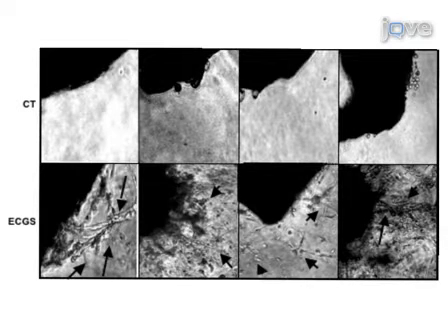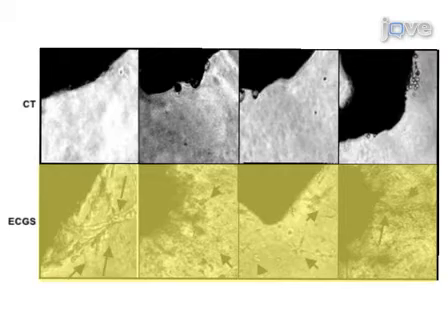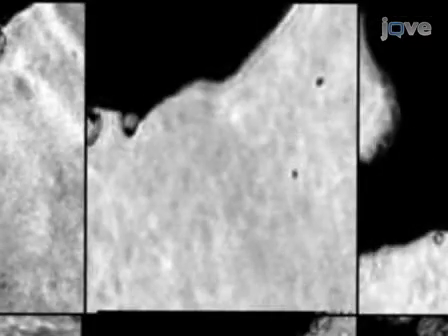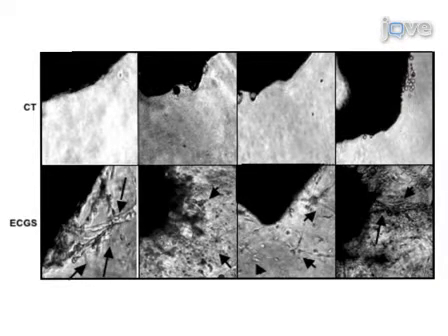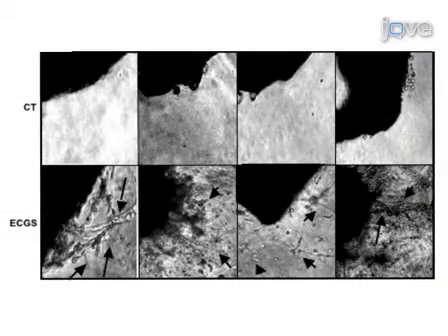These images were collected 12 days after placement of rings in the wells and incubation with either culture medium, seen in the top row of images, or ECGS used as a positive control for vessel sprouting, seen in the bottom panel. Each image is a representative snapshot of 4 out of the 12 rings, which is typically used in the assay per condition. Aortic rings that were exposed to ECGS exhibit vessel growth, and the arrows point to several of the many vessels that have formed. Each vessel is characterized as chains of endothelial cells with occasional branching, indicating that they are mature. No sprouting vessels can be observed in the culture medium wells in the top panel.